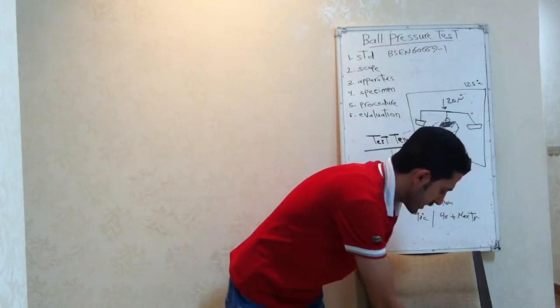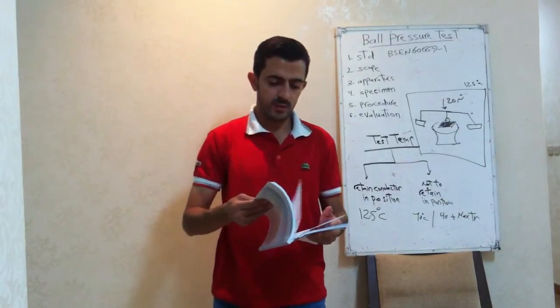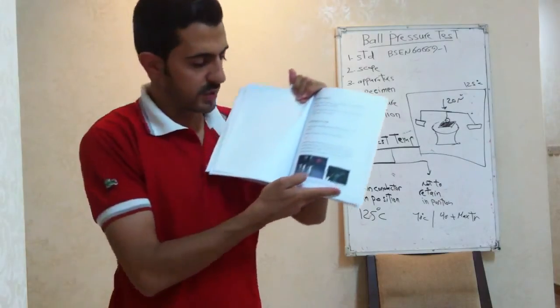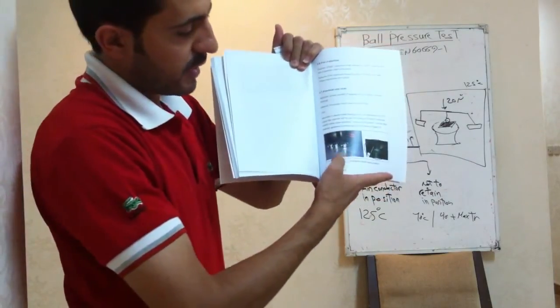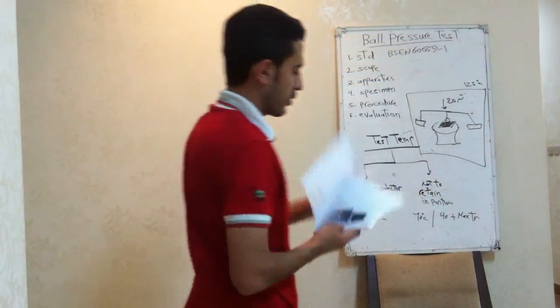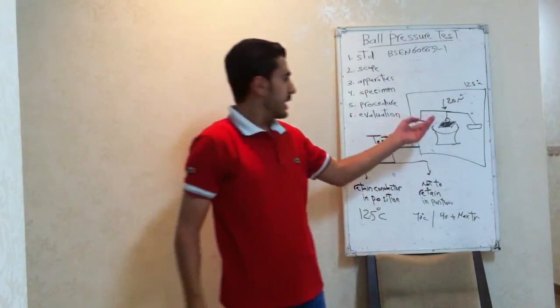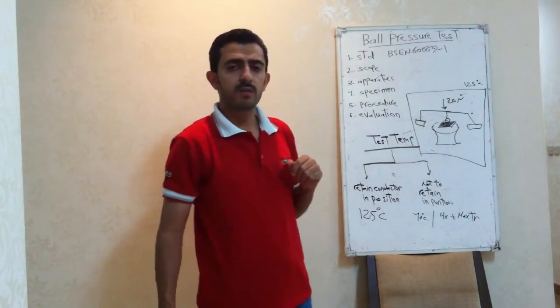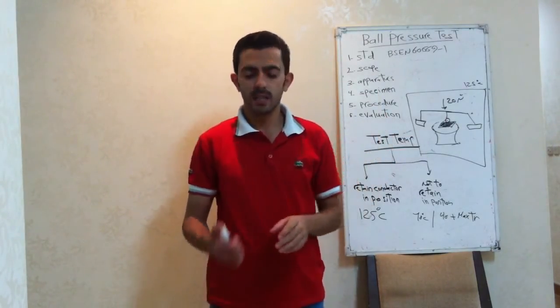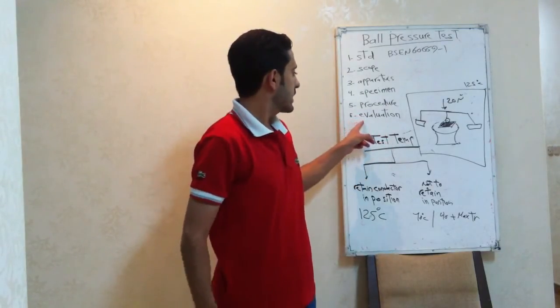I will show you the setup of this test. After one hour, I will take out the sample from the heating cabin and cool it down to approximately room temperature by immersing it in cool water. Then I will evaluate the result.